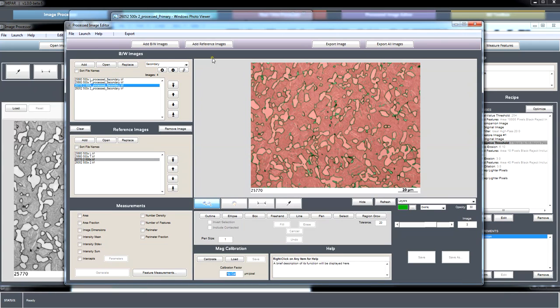and in that way you can accommodate different scale factors for each image. But you raise a good point, which is that allowing each image to have a different calibration factor, perhaps this value changes. So if the calibration factor could be stored as a tag into the image, that could make things easier for some folks. So we'll put that on the list. And everyone, please feel free to use the request feature page from the support drop-down. A few of you have posted there, and the more that post, the more things will get added. There's a voting option on those feature requests, so check out that list from time to time and vote on the ones that you want to see get added.